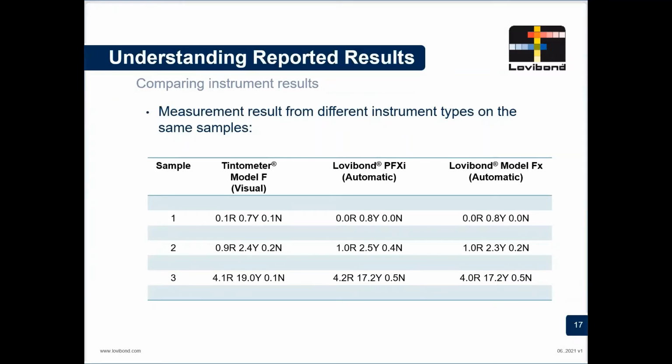And if we look across, yeah, we can see that our red value fits into that. Again, looking at our yellow value, 0.7, 0.8 level, we can expect, yeah, 0.1, 0.2 from our repeatability. At the 2.4 level, we can expect something like maybe 0.5 in our repeatability.